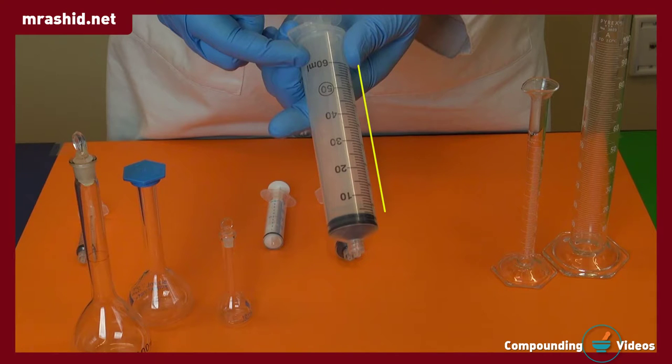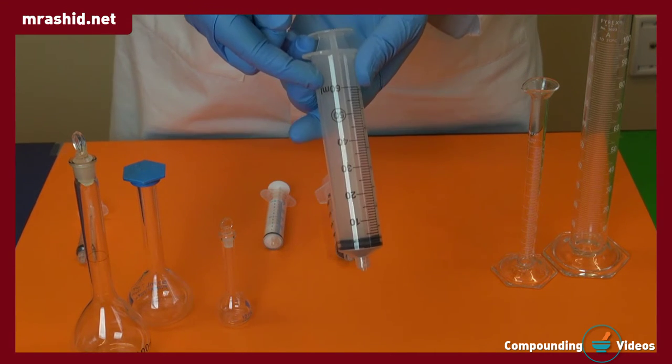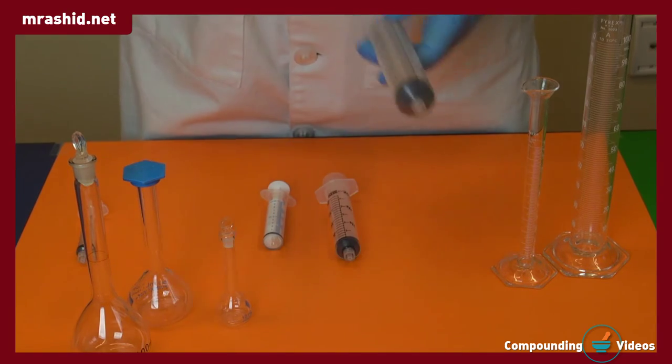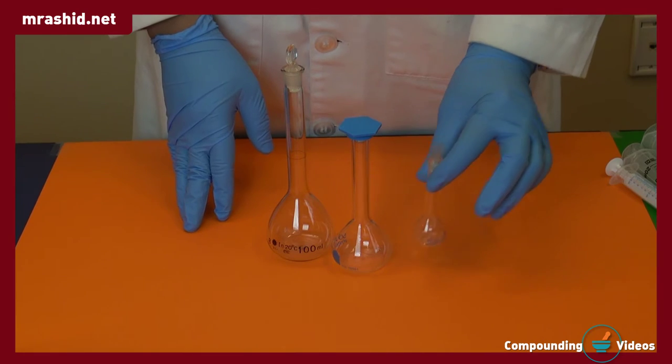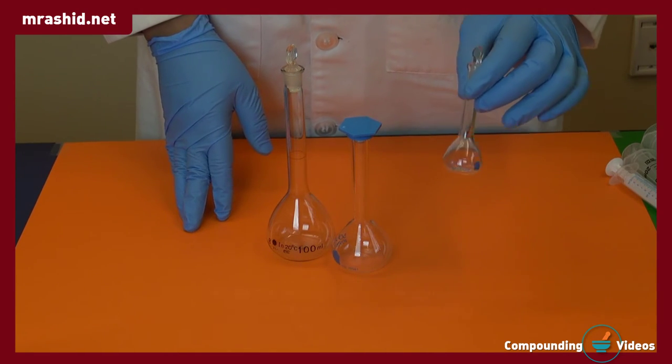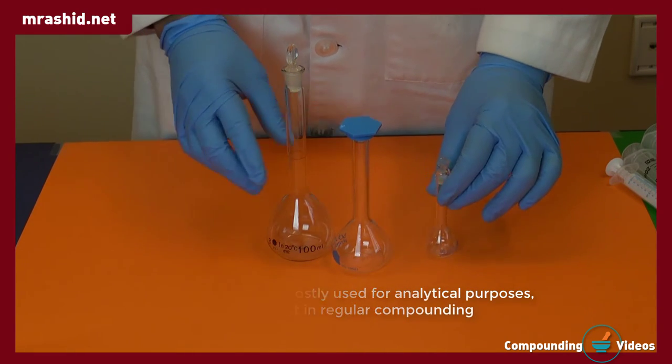Also, it has the widest diameter. Volumetric flasks may be used only in certain cases because they cannot measure above or below the calibrated fixed volume.